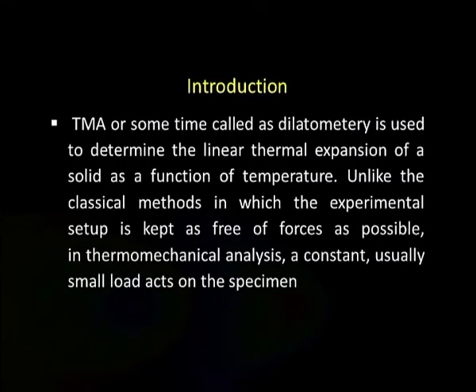TMA, sometimes called dilatometry, is used to determine the linear thermal expansion of a solid as a function of temperature. Unlike the classical methods in which the experimental setup is kept as free of forces as possible, in thermomechanical analysis a constant, usually small, load acts on the specimen.